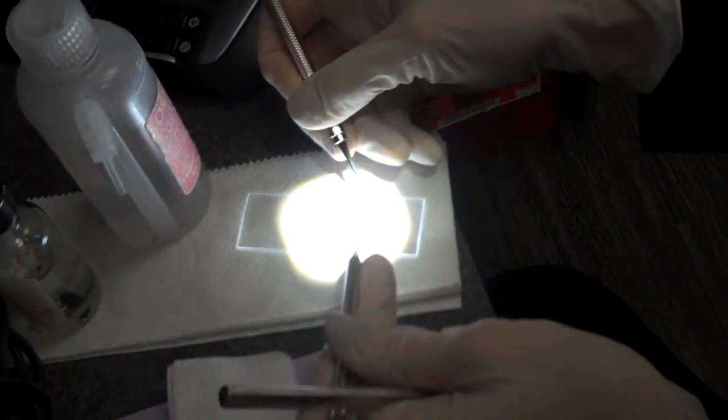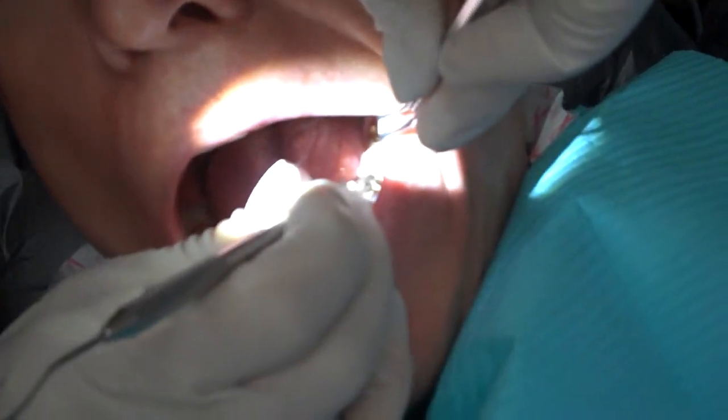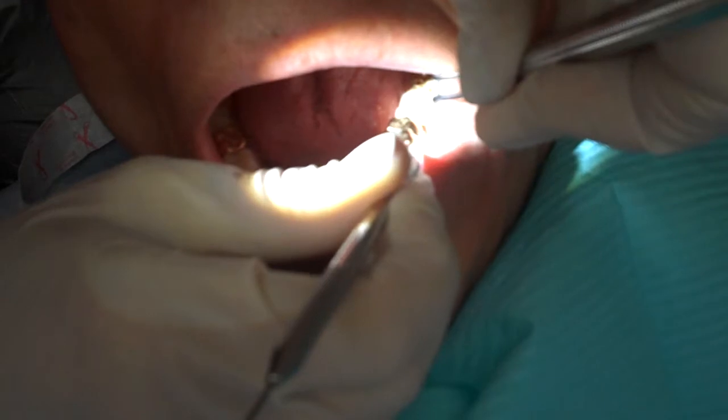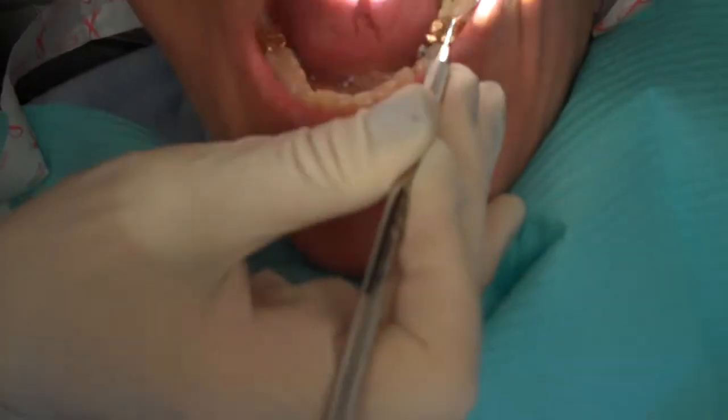You want to tease it off of the tip of your probe or tip of your instrument, because you want to try not to disturb that plaque as much as possible. I usually sample different areas of the mouth. I didn't get anything — his teeth are too clean.